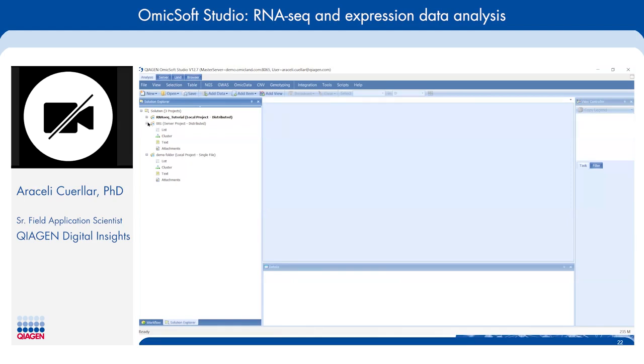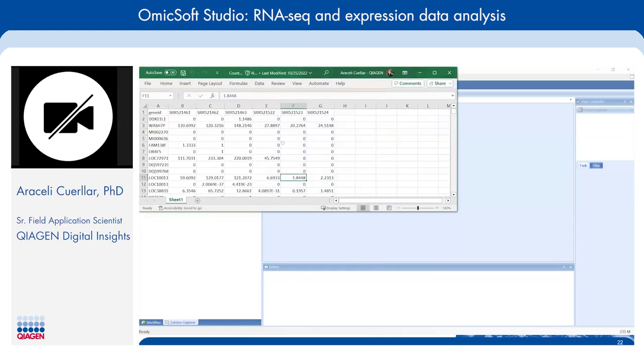For those of you that are following along, today we're going to be working with this matrix. This is the counts matrix. Here, the first column just has the genes that were quantified, and then the subsequent columns represent the samples coming from 2 cell lines. And the values represent raw counts.